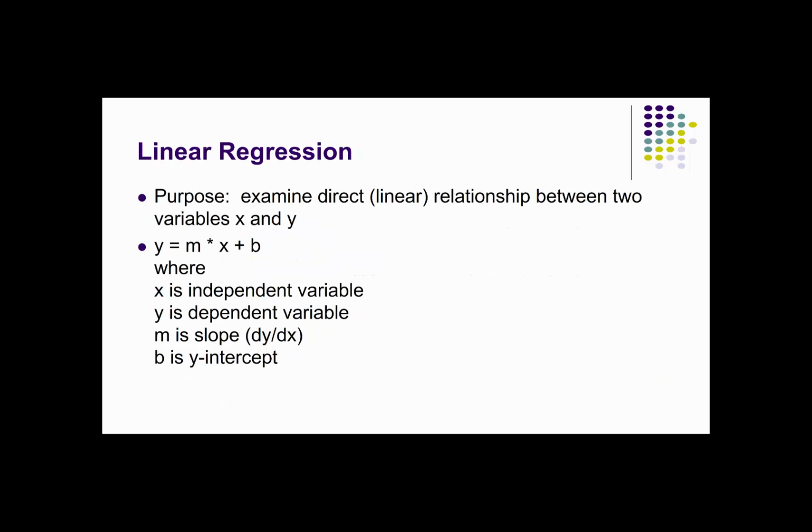So now let's talk for a bit about linear regression. From an analytical standpoint, I need to demonstrate to others that my system follows this linear relationship that lies at the base of my analysis, Beer's law. And that means I have to demonstrate statistically to others there really is a linear relationship between absorbance and concentration.